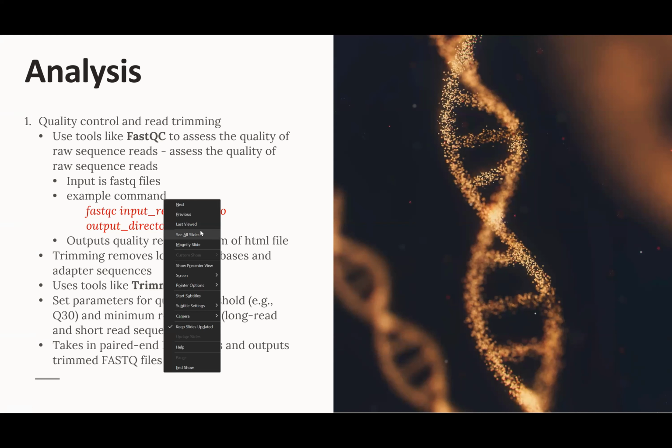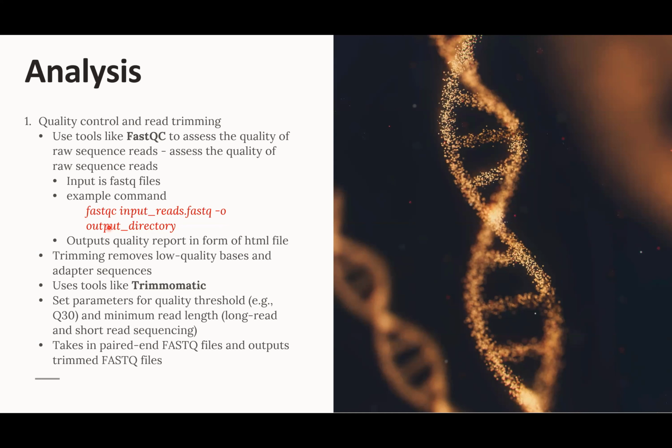I'm just gonna see if we can try to use, okay, yeah. So this FastQC command is what you will run on terminal, and then this will output a file in form of HTML, whereby you can go and open it and check the quality. So that usually shows things like the Phred score, how good your reads are, and all that.